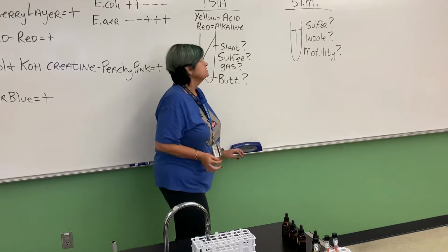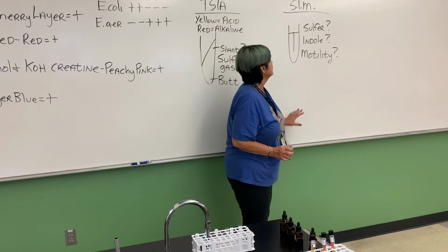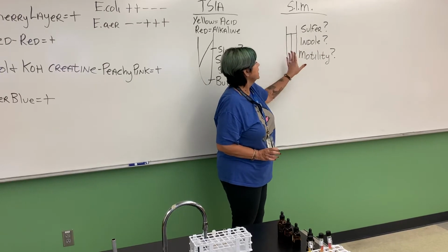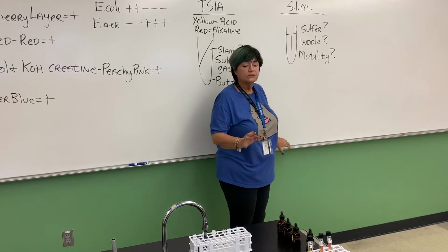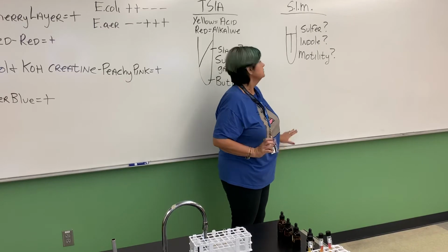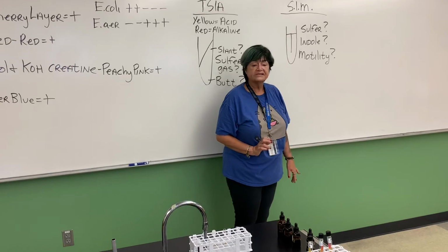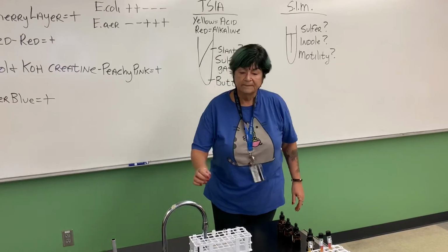The last one is the SIM. And that is testing for 3 things. For sulfur, which will turn it black. Indole, we'll be adding the Kovacs reagent. And then motility, is it cloudy? So I have an example here of one.